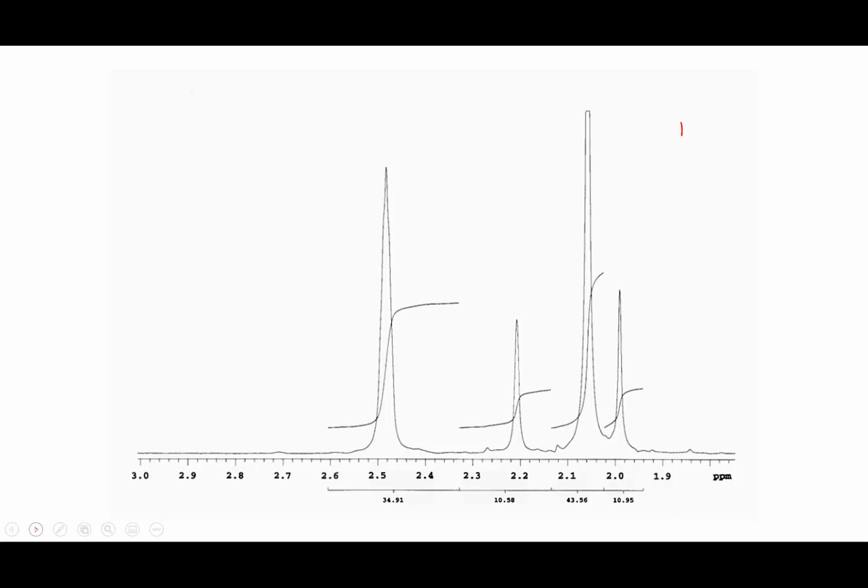So here is the spectrum. This is the DMSO peak. I integrated it as quickly as possible.